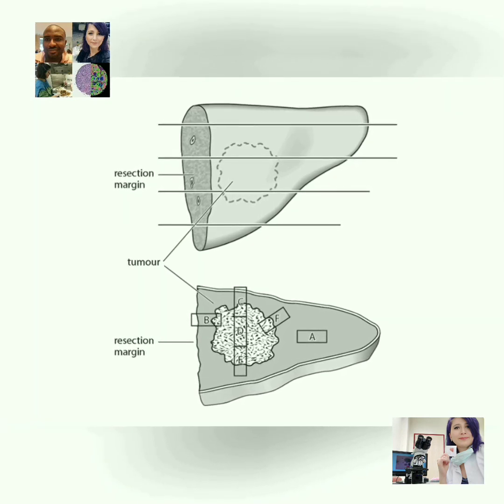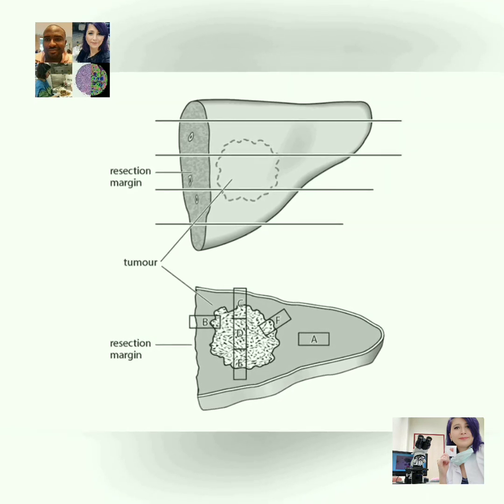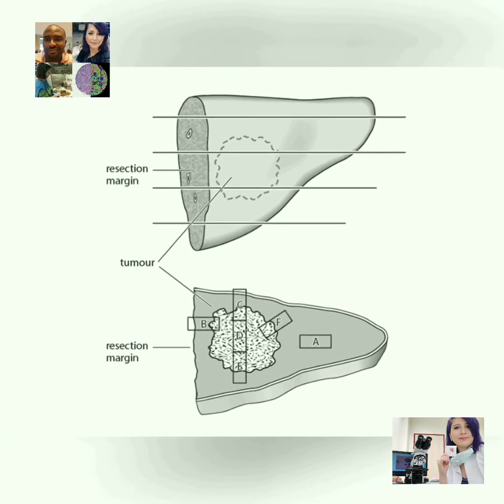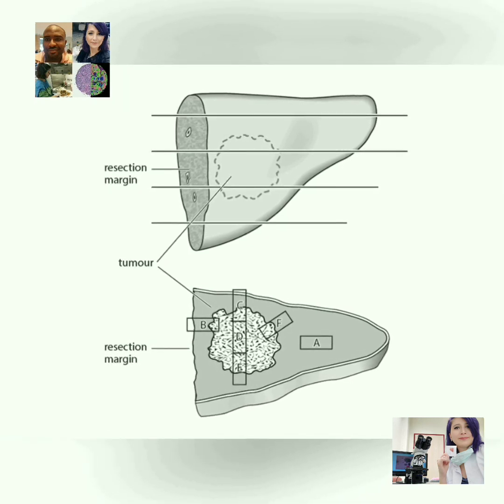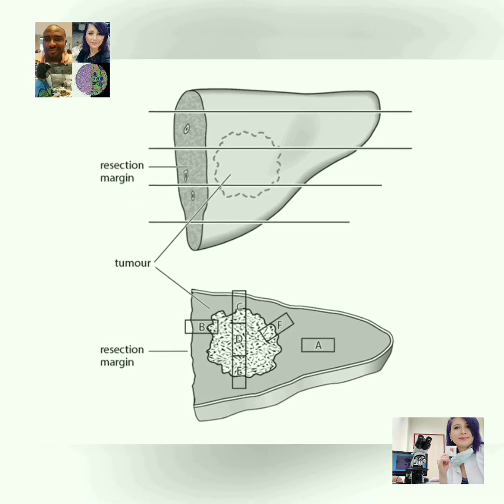Alternatively, it could be renumbered as cassettes 1 to 8, where 1 could represent the vascular margin, hilar vessels, or shaved section. The numbering of the cassettes should be ordered and usually at the discretion of the dissector.